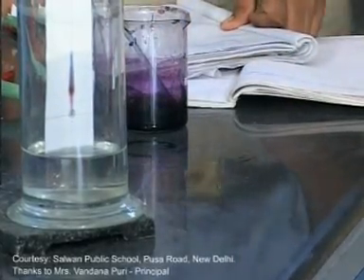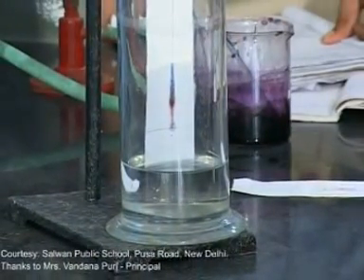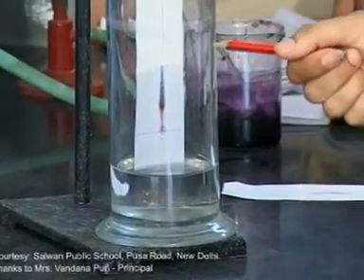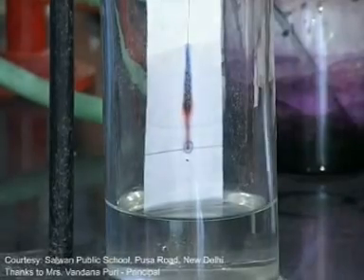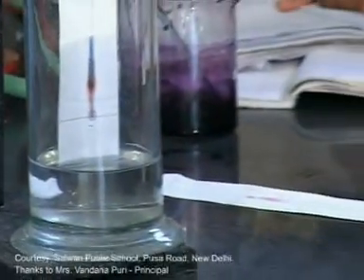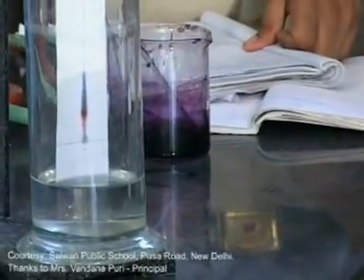Now before we conclude the experiment, you can see the solvent has risen further and the red and blue ink have started separating out. This paper showing the separated red and blue inks is called a chromatogram.